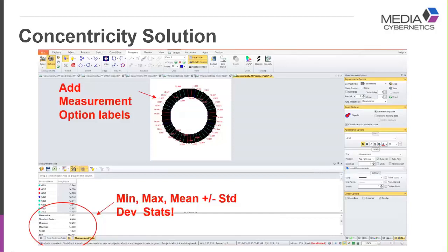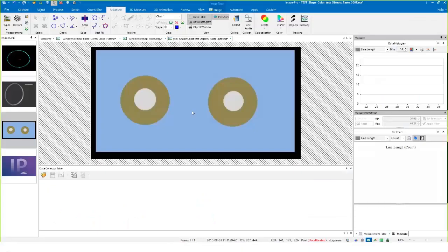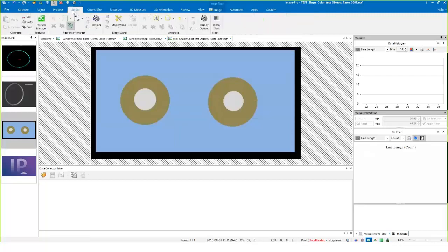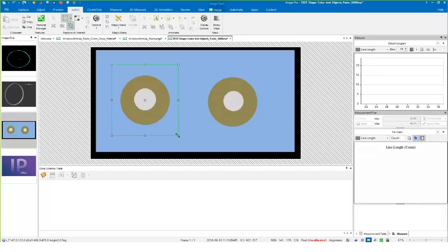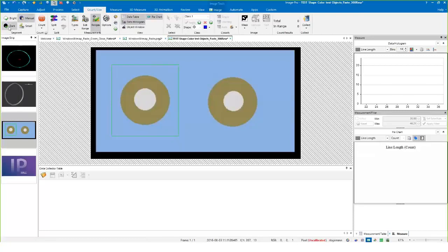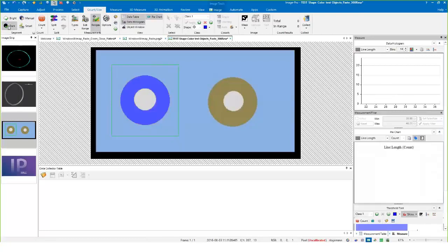If you want, we can take a quick peek in Image Pro and I'll show you how I was going about doing this. Here's a sample with two objects. It may be apparent, but maybe not, that one is shifted off. I was using a region of interest like this so I could take two separate measurements and compare them.